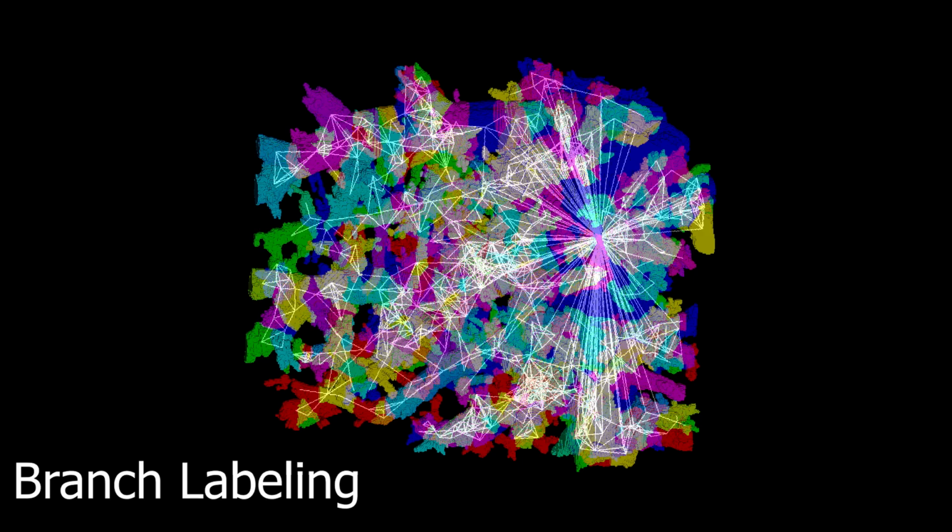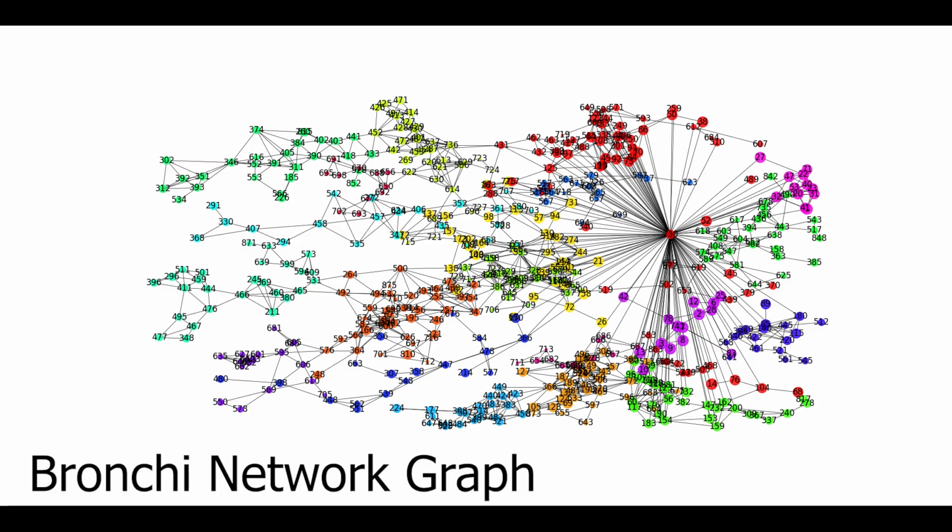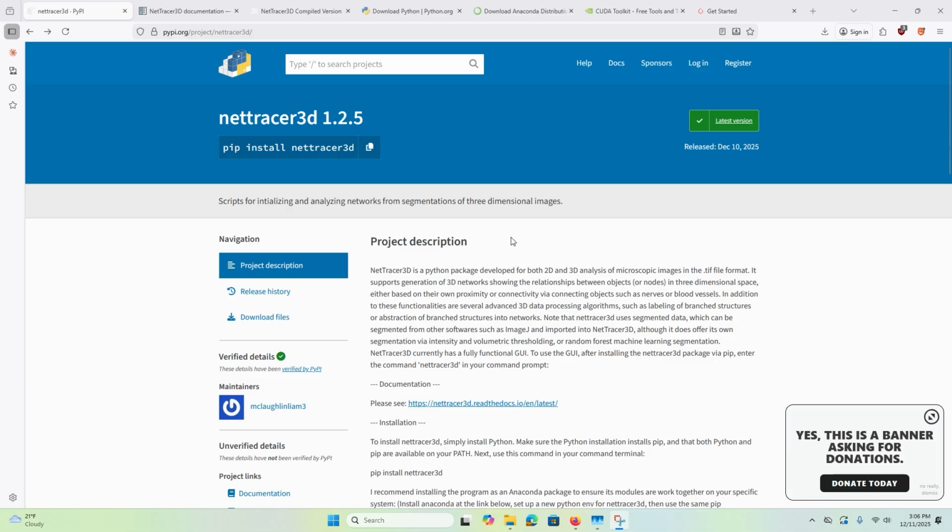I'm not going to go over everything it can do in these videos, but I will do some demonstrations of different analysis as a quick start to help people get started. So first of all, let's just talk about installation.